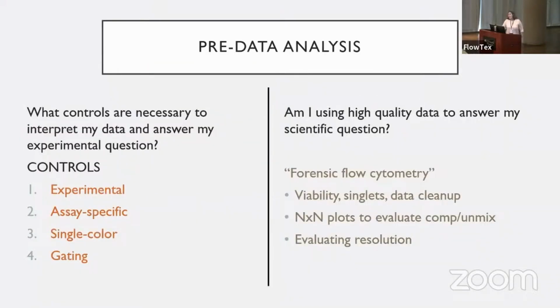So we're going to do what I like to call pre-data analysis. I know last year at FlowTex, you guys did an entire huge workshop on high parameter, high dimensional assays, right? We're not going to do that today. This is actually going to be, what do you do with that data that you collected before you get there, and how do you get to that point?